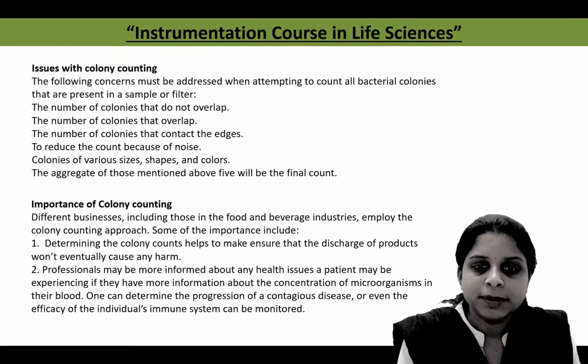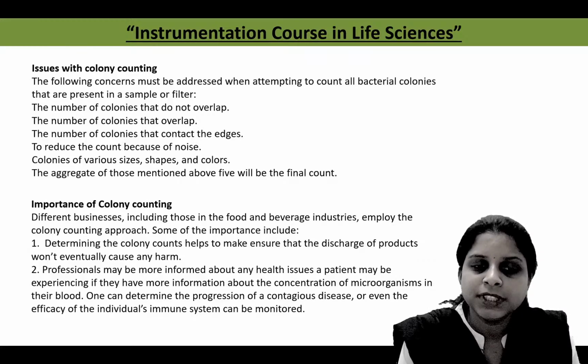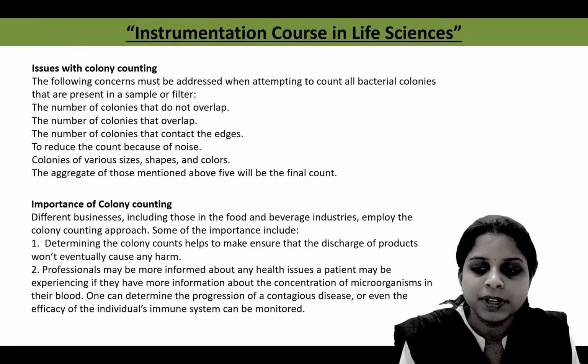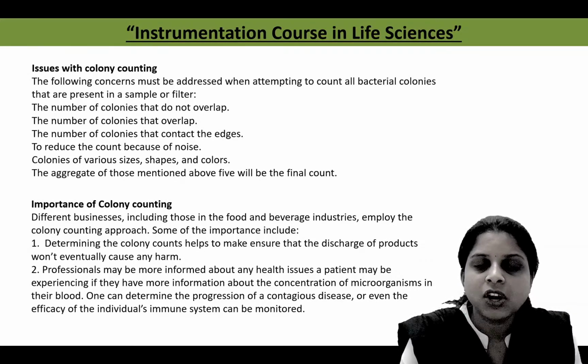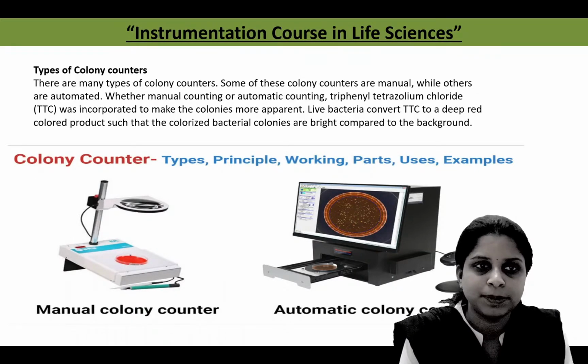Once we determine the number of colonies in blood or any other samples, the results can be used in medical microbiology or in a pathological laboratory, that is, how many bacterial cells are present in the patient's blood sample.